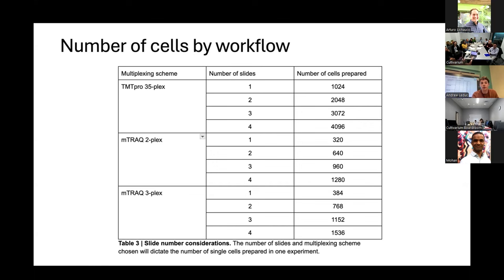And so we could, of course, jam more 2-plex cells onto 4 slides, but at this rate, to do all these, the pickup takes about 5 hours. I mean, you saw it in the morning. It's super hands off. I don't ever think about it.